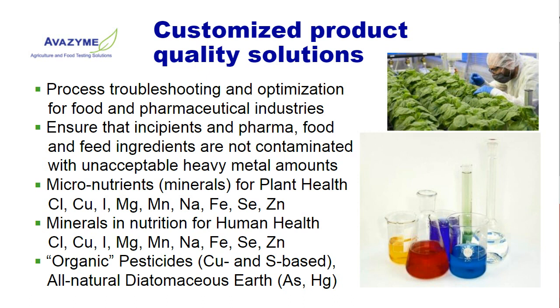So with the help of ICP-MS spec, we can determine the levels of micronutrients in plants, in the soil. We can assess how minerals are being taken up by plants. Sometimes this can be facilitated through certain soil microbes and the microbiome of the plant. And there are ag-tech companies that actually are making products that help plants to be healthier, stronger, and more nutritious by maintaining the appropriate micronutrient levels in the crops and in the soil.